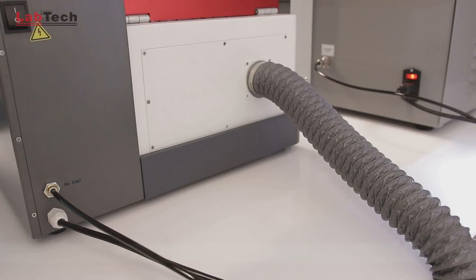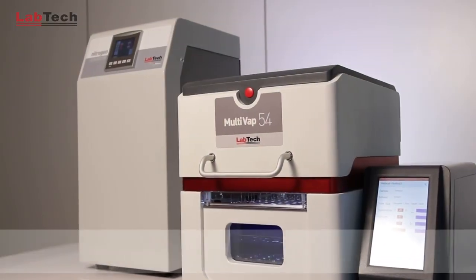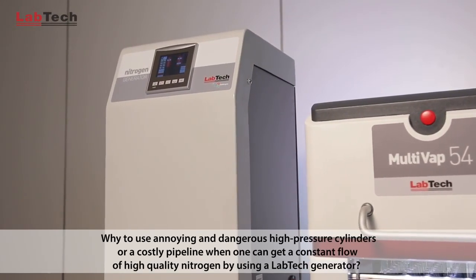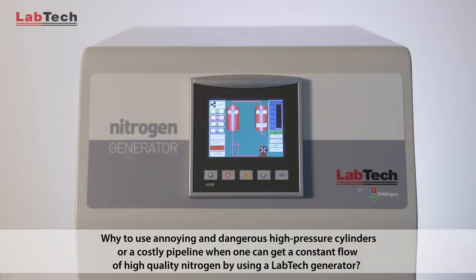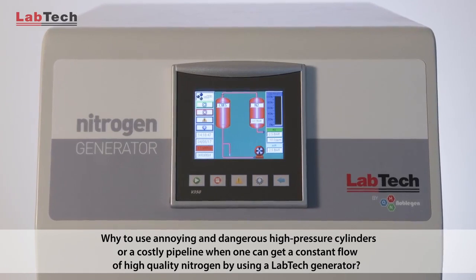The instrument comes with a built-in vapor exhausting system that avoids the need for a fume hood. A good automatic concentrator is nothing if not supported by a proper source of nitrogen. Why use annoying and dangerous high-pressure cylinders or a costly pipeline when one can get a constant flow of high-quality nitrogen by using a Labtech generator?